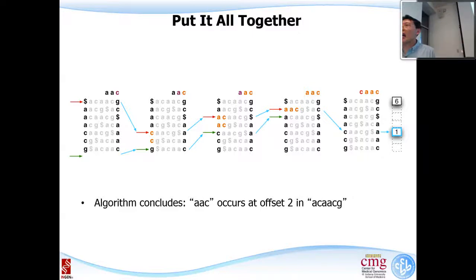That is your indexed genome, although indexed in a strange way. It's the same size as your reference genome. If your reference genome is human, 3 billion letters, you only need 3 gig of memory, and you can load the entire human genome in that.